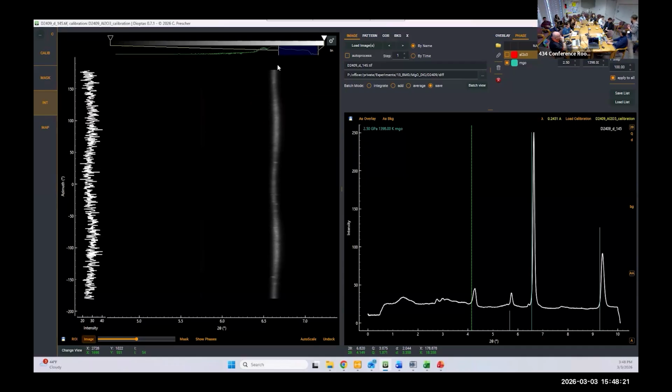And the equation that we use is this one here. So this is strain, but it's lattice strain, not to be confused with the macroscopic strain of the sample changing shape. You'll have a term that's related to the pressure strain, the hydrostatic term, and Pam talked about this. And then you'll also have, often written as Q, this term which relates to the differential stress.